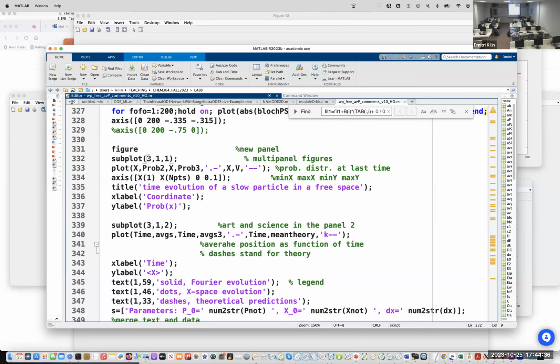The command here tells that there will be a total of 3 panels within one figure.